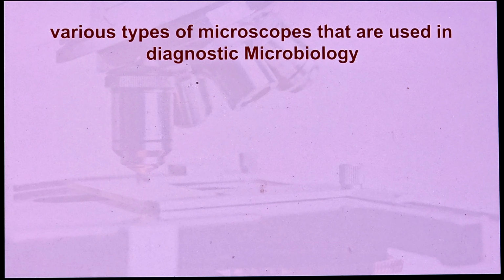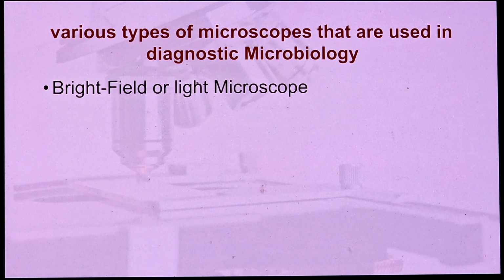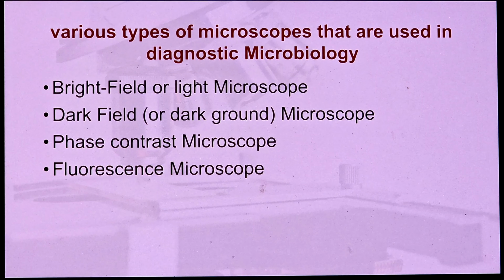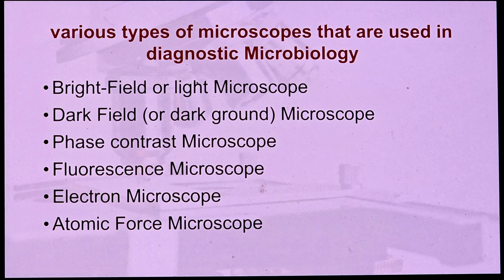Various types of microscope that are used in diagnostic microbiology. First, bright field or light microscope. Second, dark field microscope. Third, phase contrast microscope, fluorescence microscope, electron microscope and atomic force microscope.